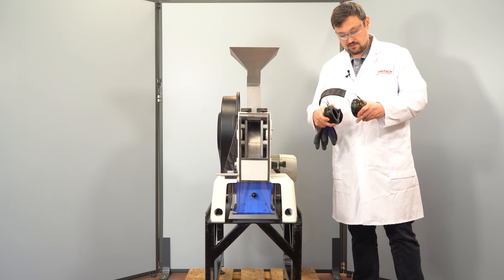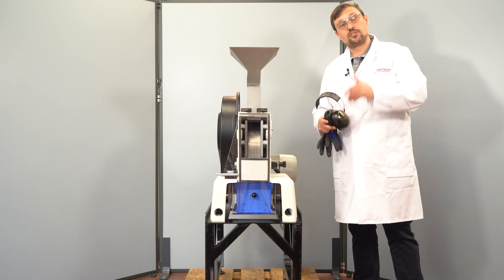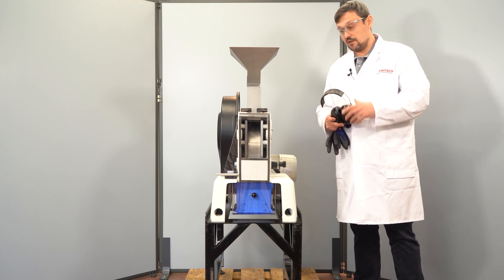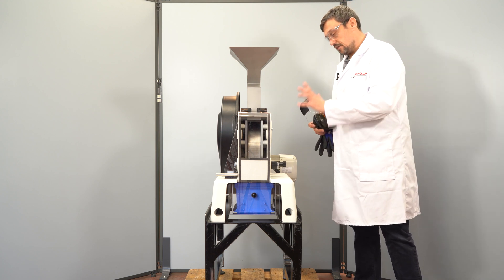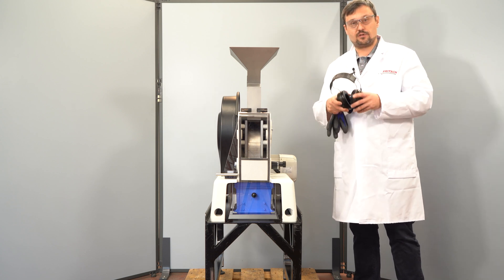Another important aspect is the noise during grinding, which depends on the sample you are processing. It is necessary to use some kind of ear protection.